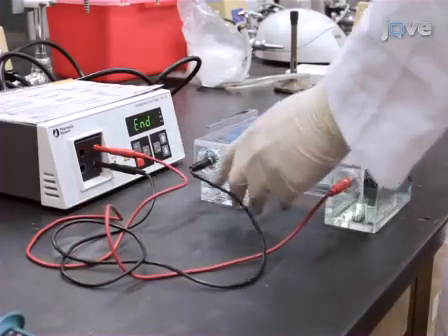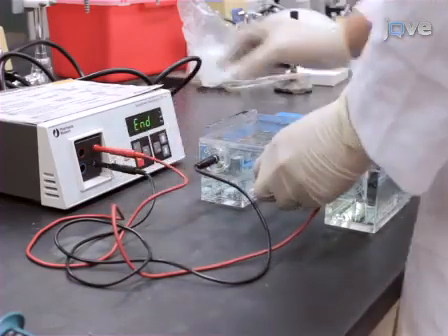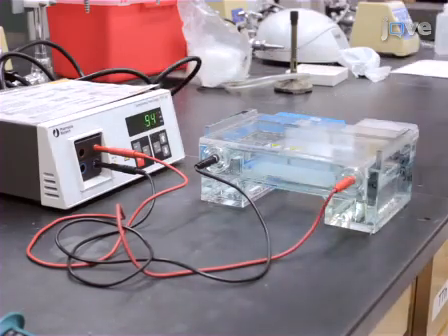Replace the lid. Double check that the electrodes are plugged into the correct slots in the power supply. Turn on the power. Run the gel until the dye has migrated to an appropriate distance.